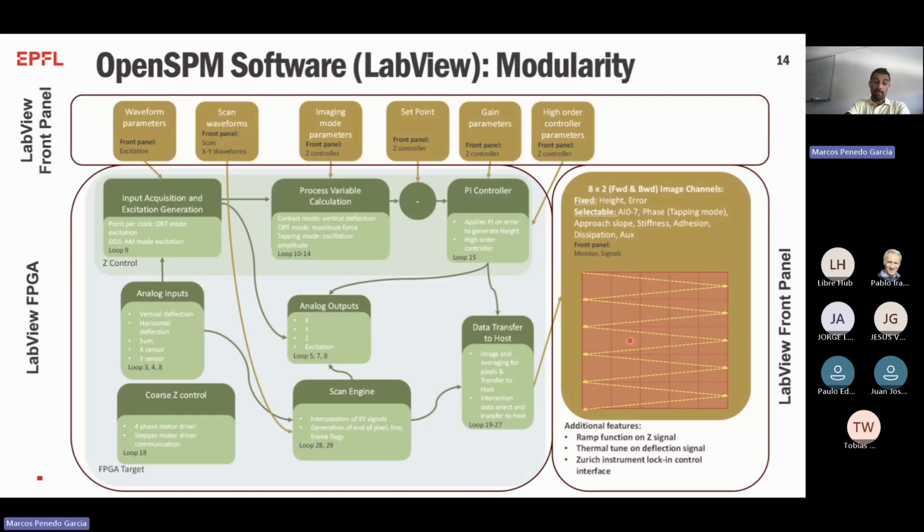Then the software, as it is National Instruments, we fully program it in LabVIEW. It's true that now we have not only LabVIEW, we have different parts written in Python and also in C, depending on the requirements, but the whole core is mostly written in LabVIEW. So of course, if you need to make any changes in the code, you will need to have LabVIEW licenses. But if you are only a user, we also provide a compiled version that doesn't need any licensing. You only need to have the LabVIEW runtime environment, which is free, in fact.